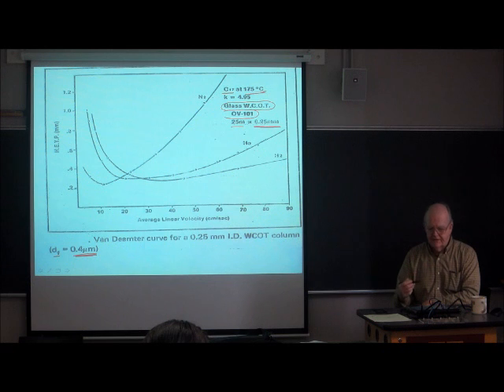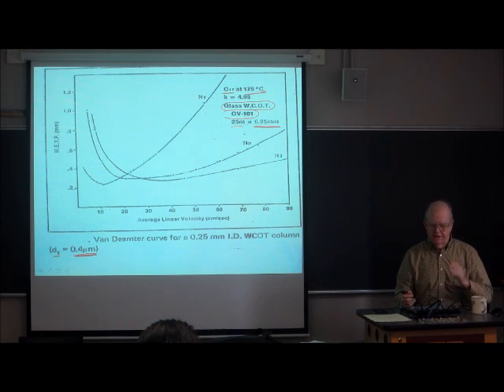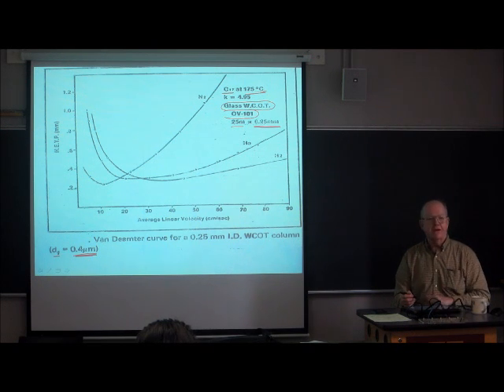And under these conditions, the retention factor of the heptadecane is about 5. And it doesn't matter which gas you use, you will get the same retention factor. And the reason is that under these conditions, the gas phase is ideal. Now, something you learn in general chemistry is that in ideal gases, there are no intermolecular interactions.